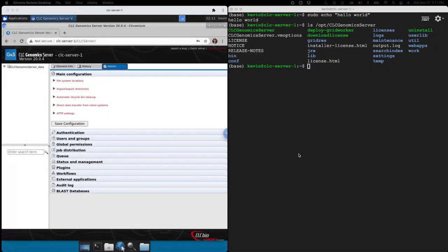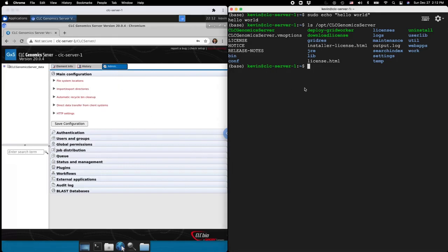The first step to writing this IVAR external app is the installation of IVAR onto our genomics server environment. I'm going to assume that you already have CLC Genomics Server installed and set up on your system and that you have access to the same things I've got here on my screen — a terminal with root privileges on the right and the server web interface logged in as an admin user on the left, with the CLC Genomics Server installed in that top-level opt directory.